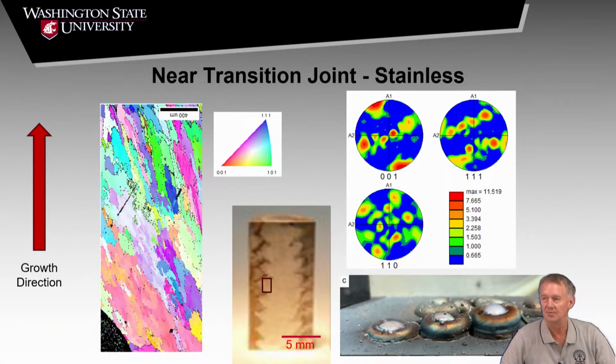Anybody else? To see the periodicity, we have to go from top to bottom, not like this. Right. Well, maybe. We don't know how it's periodic. If we're trying to measure an orientation coherence function, we try to do it in all possible vectors, all possible R's. And you don't have to stitch the data together to get this information. You just have to know where your scans are relative to each other. So you can do one, 100 microns over and 100 microns over, and they don't have to be stitched together like I showed you.